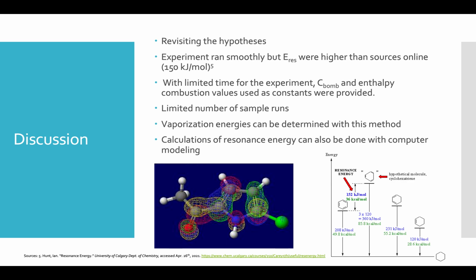As a whole, the experiment ran smoothly, with no reported problems from those involved with acquiring the data. The final result of 235.95 kilojoules per mole was significantly higher than results found from an online source, which stated the resonance energy of benzene was around 150 kilojoules per mole.